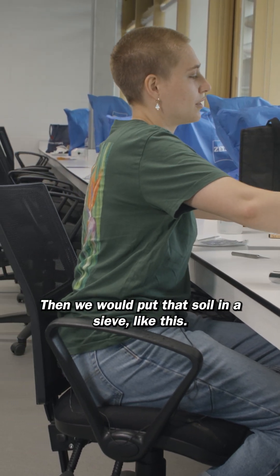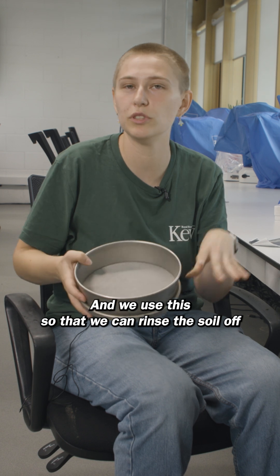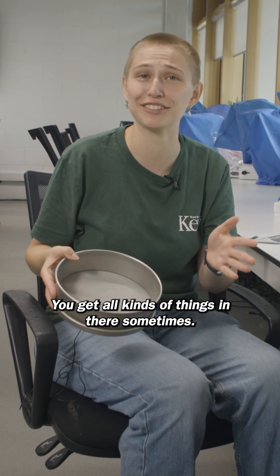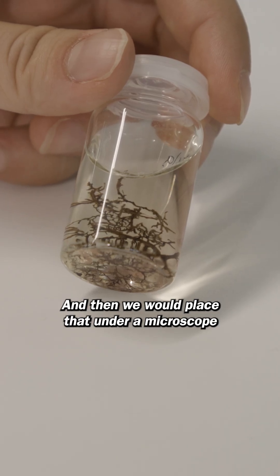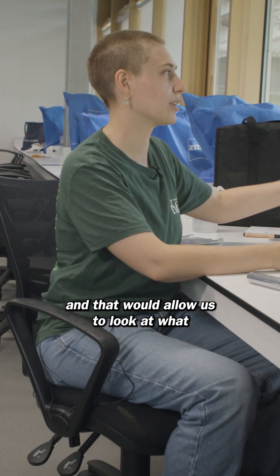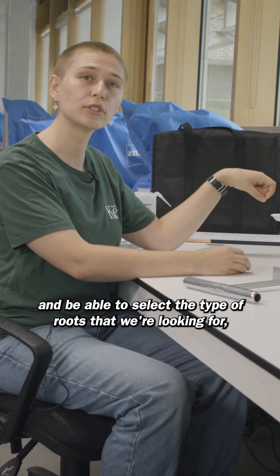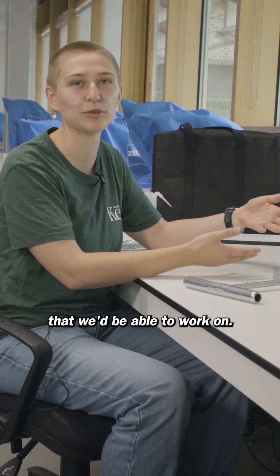Then we would put that soil in a sieve like this, and we use this so that we can rinse the soil off and see all the things that are in it. What we're interested in is the roots, and then we would place that under a microscope like this, which allows us to look at what we're seeing in more detail and select the type of roots we're looking for — or just anything that looks living and healthy that we'd be able to work on.